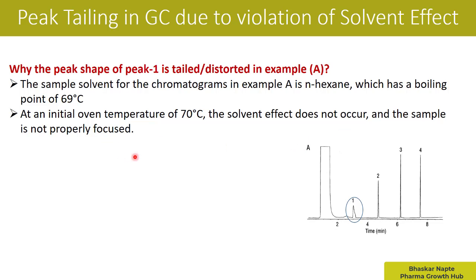Now, why does the solvent effect not occur in this example? The requirement is that the initial column temperature should be 10 to 30 degrees Celsius lower than the boiling point of the solvent. The boiling point is 69 degrees Celsius, so ideally the initial column temperature should have been around 49 to 59 degrees Celsius. In that range the solvent effect could have occurred. But at 70 degrees Celsius it is not going to happen, and that is why you see a lot of peak tailing and distortion of peak one.